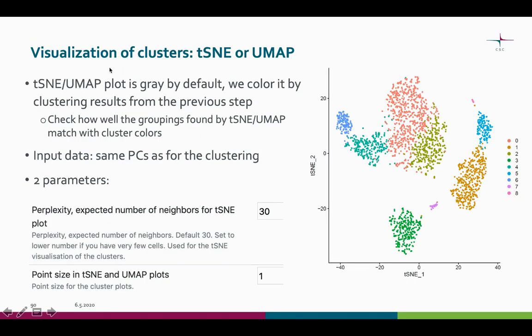After the clustering step, we want to visualize the clustering result using the dimension reduction method TSNE or UMAP. The plot resulting from TSNE or UMAP is gray by default, but the tool colors it based on the clustering result from the previous step. Your job is to check how well the groupings found by TSNE or UMAP match with the cluster colors — for example here, it's matching very nicely. The input data is the same principal components used for clustering.